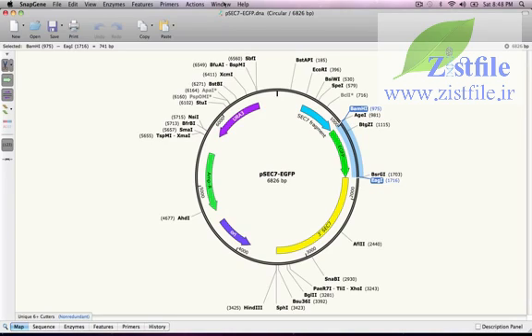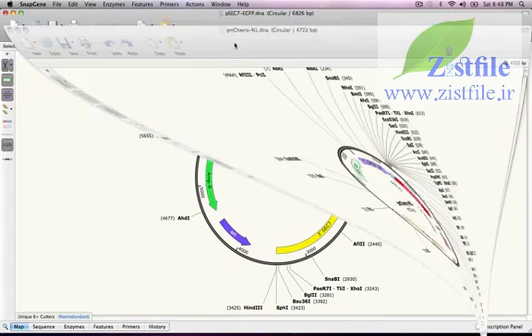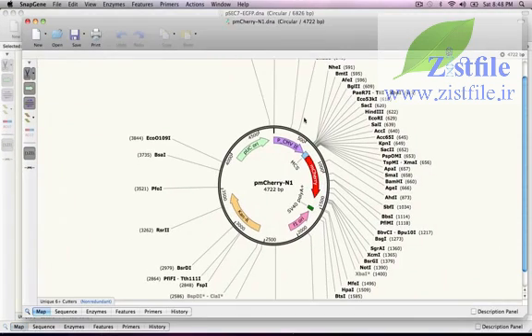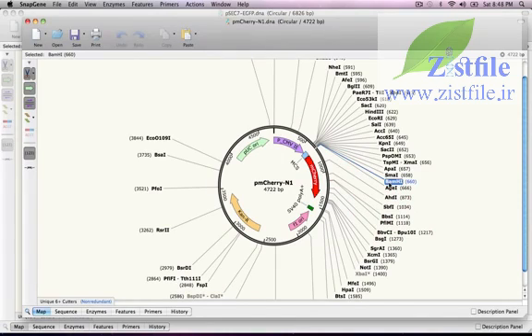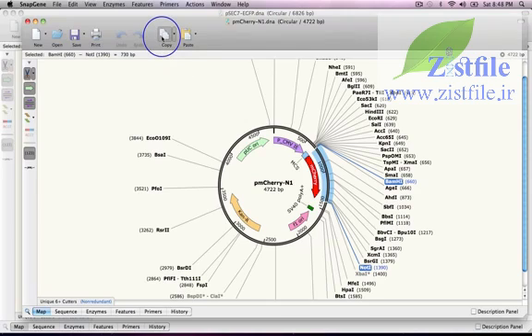First, I'll switch to the window for the MCherry plasmid. The fragment I want to insert is the BAM-H1-NOT-1 fragment containing MCherry, so I'll click on BAM-H1, then hold down the mouse button and drag to NOT-1. Now I'll copy that fragment by pressing the Copy button in the top toolbar.